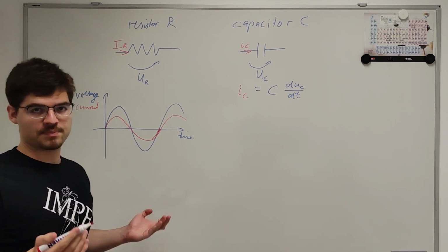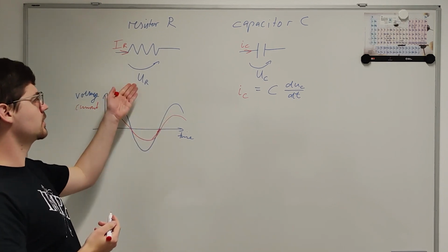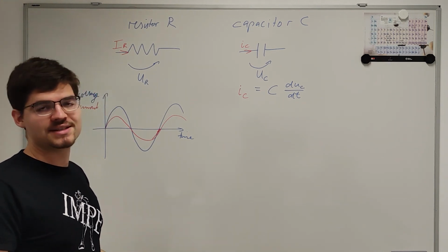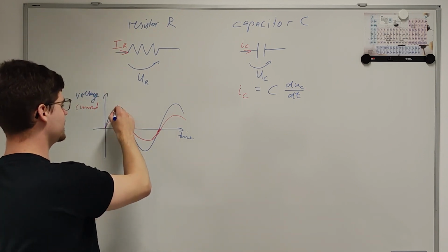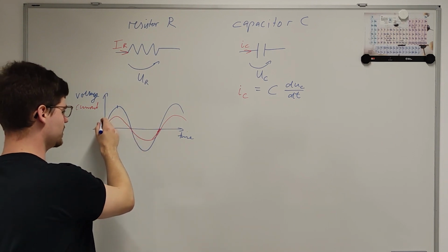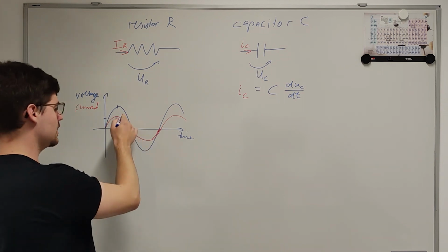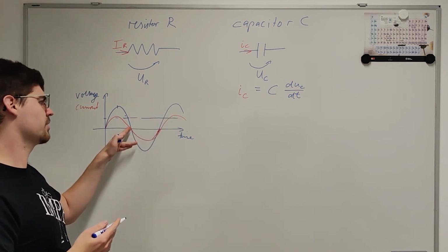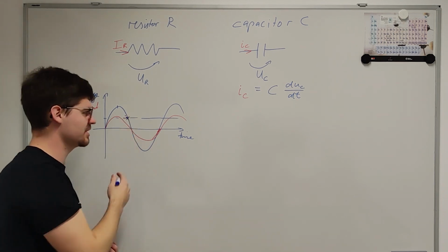Now, as we can see, if we calculate the quotient of these two quantities, voltage and current, we will find that this turns out to be essentially the same value in all points where we calculate. So, if we divide here, this voltage value by the corresponding current, we will reach something just arbitrarily put here, for example. And we will find the same quantity here in all places, essentially, if we definitionally exclude the places where both quantities tend towards zero, where the function is not defined. So we exclude these points.